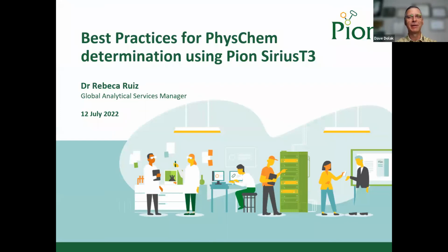Thank you, Rebecca. We did have a few questions come in. One of them came in fairly early on, and you touched upon it on your summary slide with co-solvents. If you're using something not on the list, contact Pion. The question is, what happens if I use a co-solvent that is not on the list? I guess the question becomes, if it's not on the list and they contact Pion, what happens next?